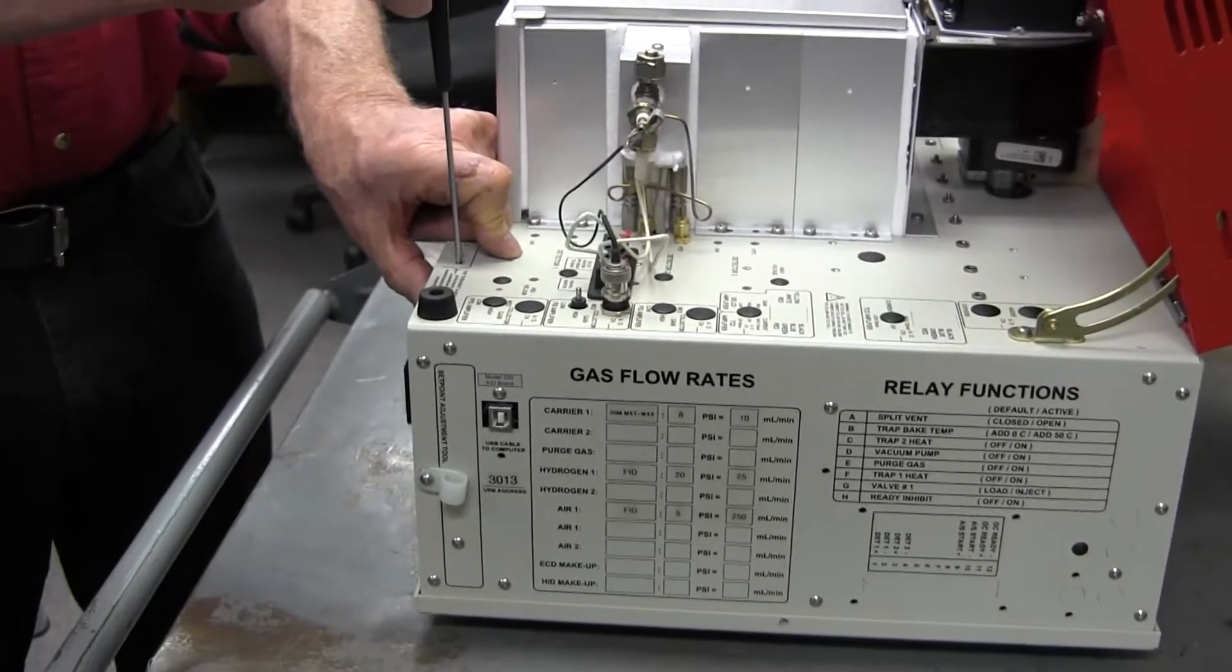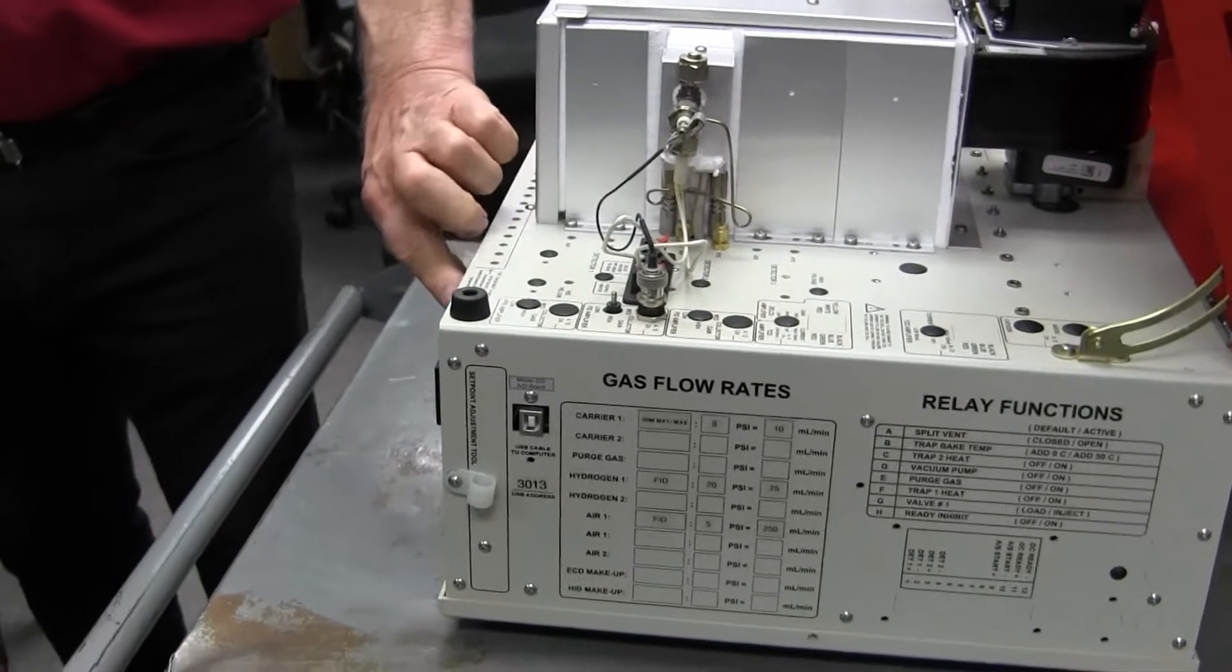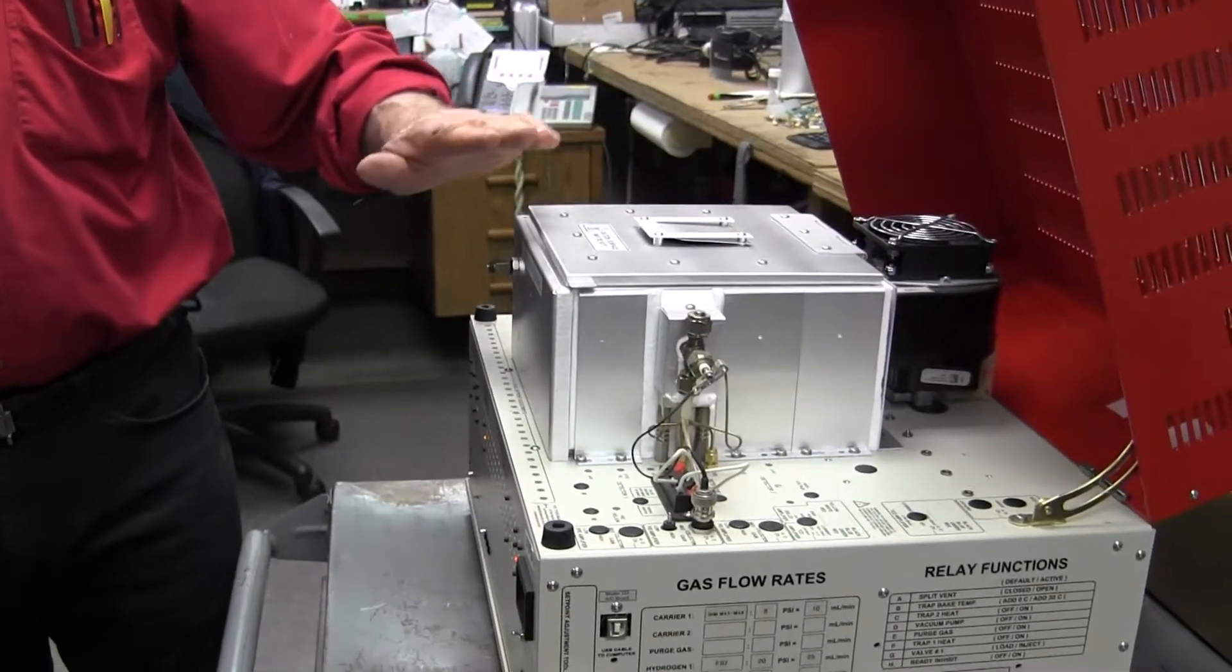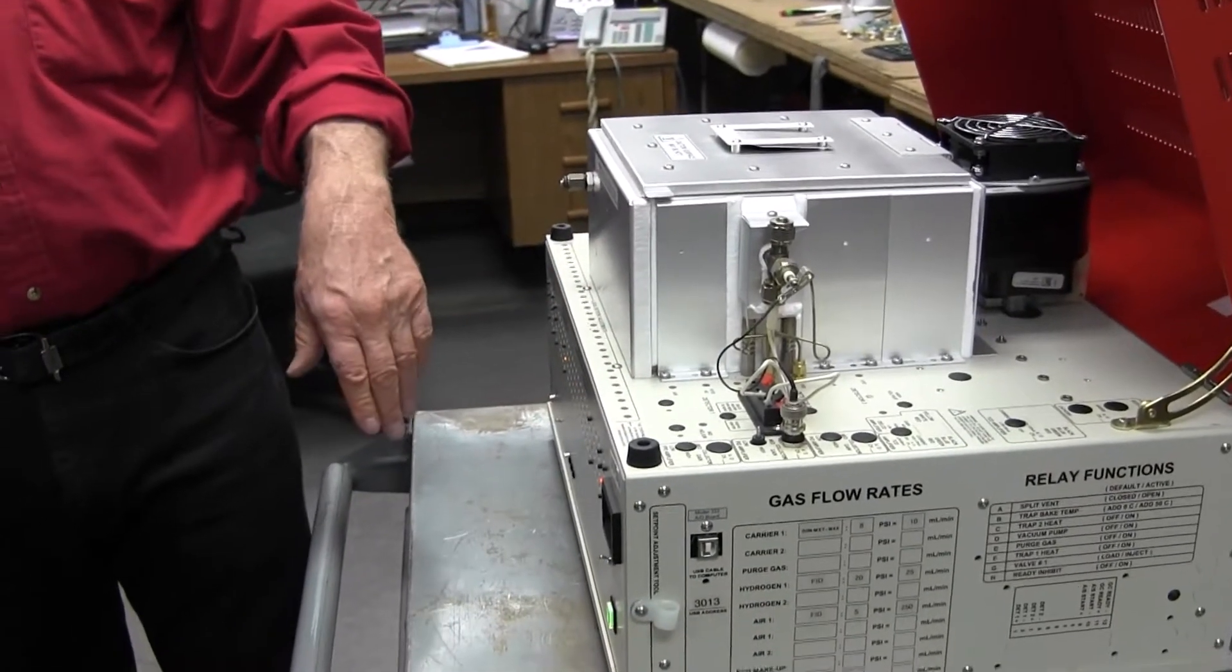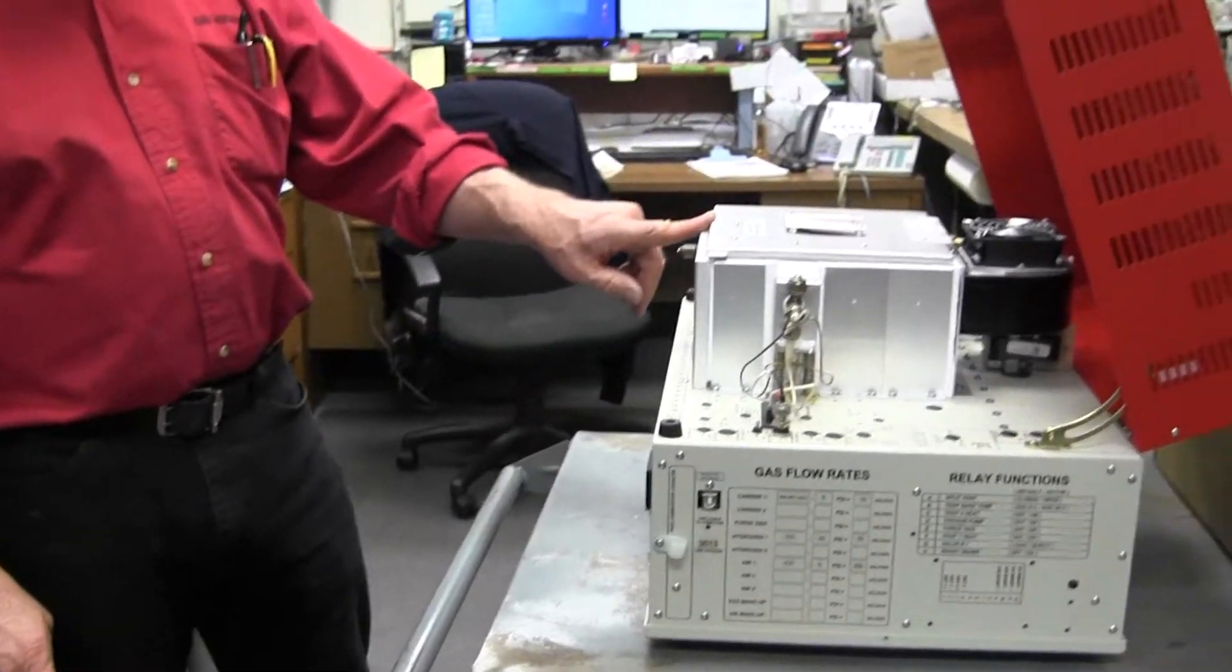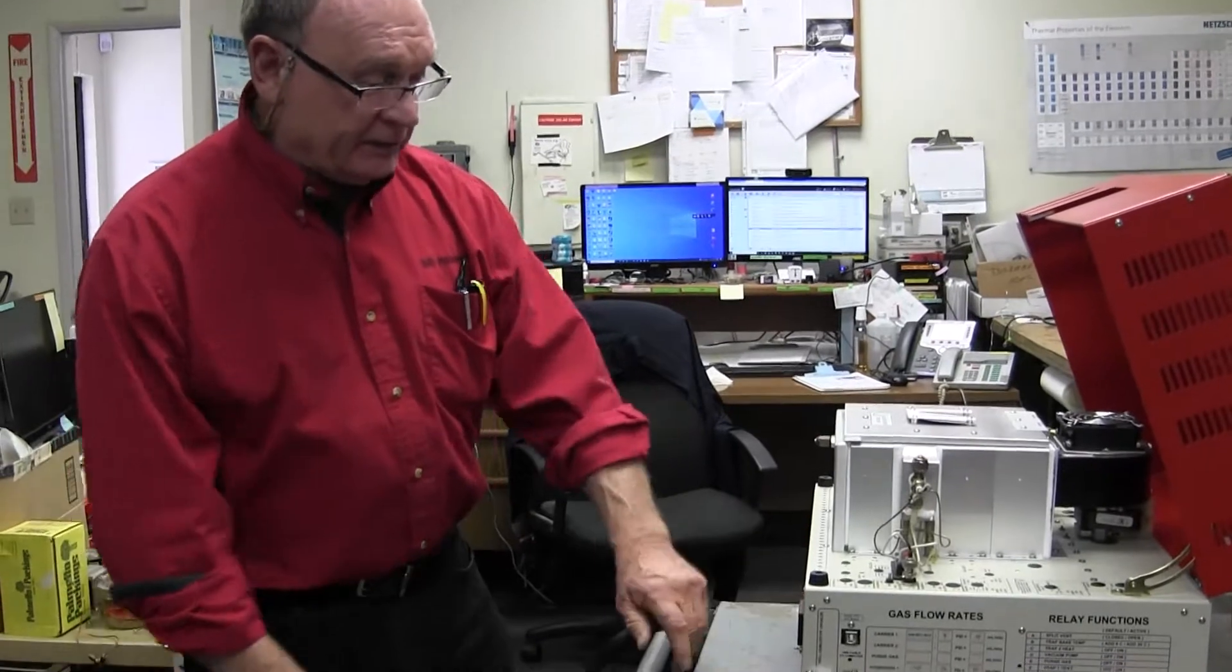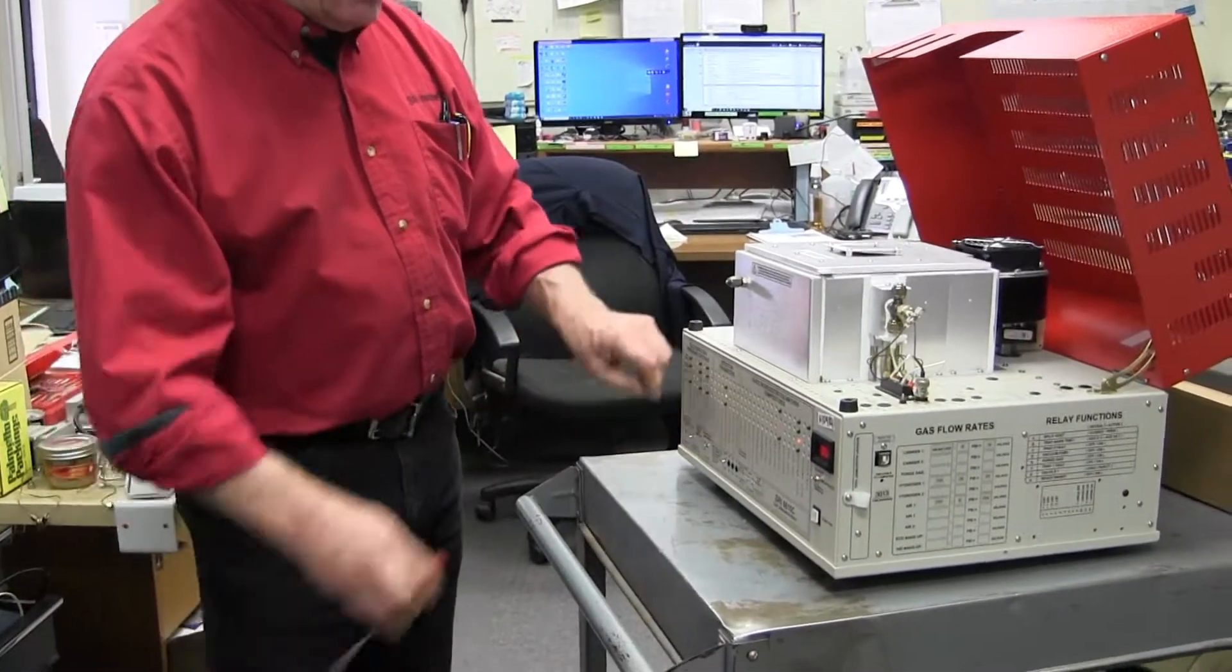So if I change the set point to 70, then that becomes the maximum temperature that the GC will let the oven heat to, regardless of whether it's just a setting or whether it's happening in reality. So that's one reason why if the temperature of the oven rises higher than the oven max, then this red light should come on.